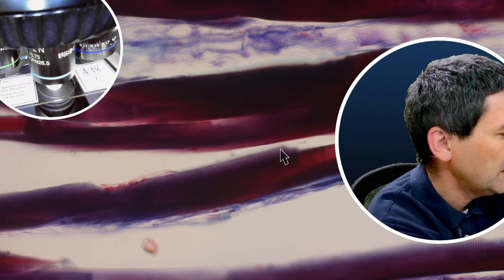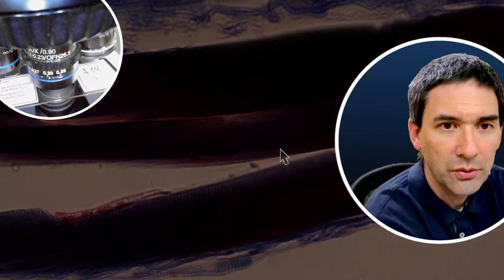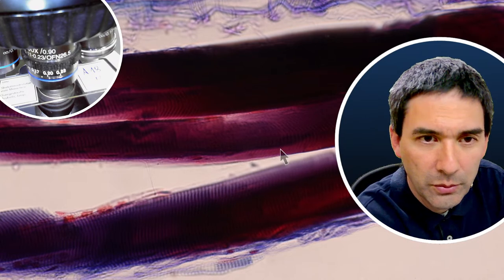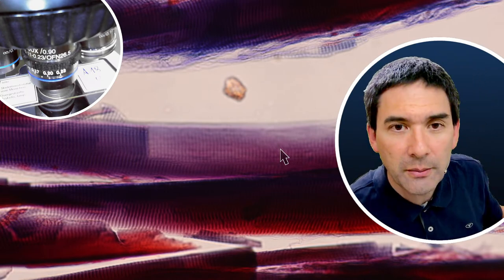And these are now the muscle fibers. And I have to go up really high with the magnification. Maybe I'm going to close it, and here we go. Yeah, so some of you might be already familiar with this, but that is skeletal muscle of a human being, and there is something very typical. Please also watch the video where I put some chicken meat under the microscope, because you can also see it, and it's very easy for you to try it as well.